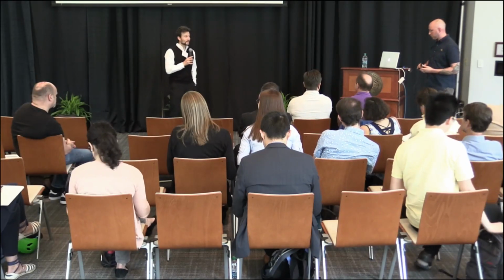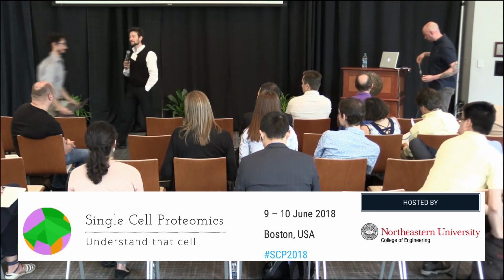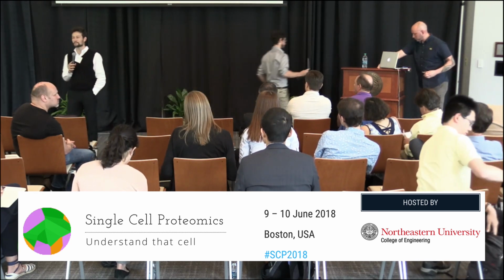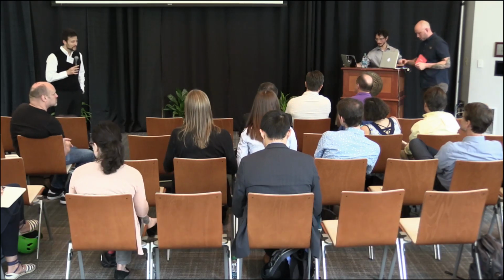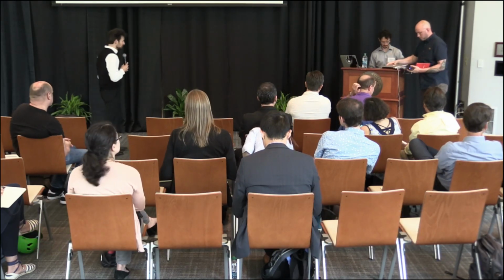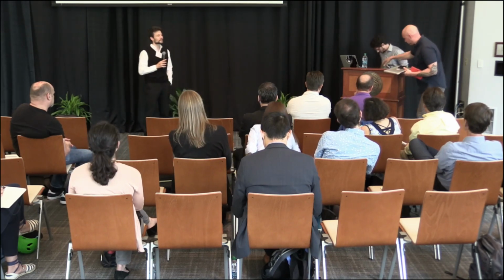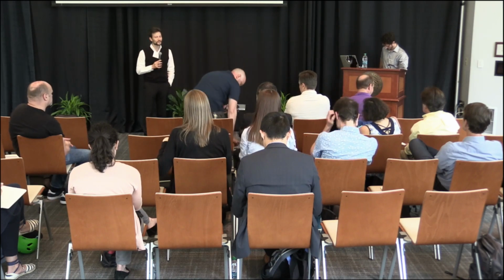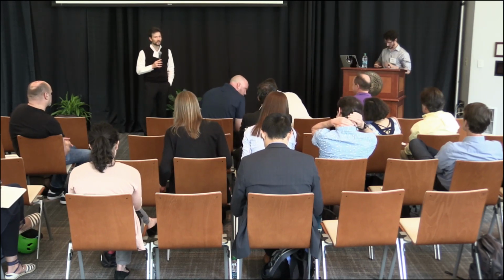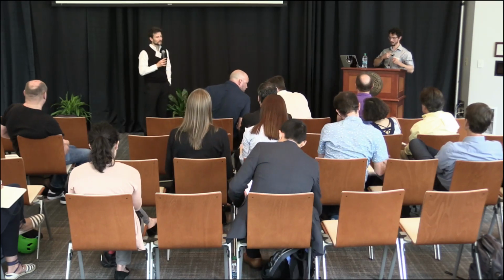So yesterday morning, I told you about a cell lysis method that is very clean and that we're very excited about, but I didn't tell you anything about how it works because I wanted to reserve this privilege for Harrison Specht, a doctoral student in my laboratory. And Harrison is going to tell you what we think is a promising way of lysing single cells so cleanly that there's nothing to remove.